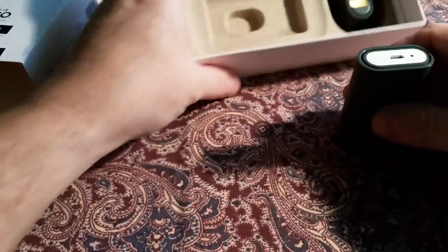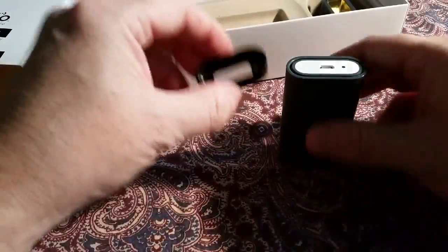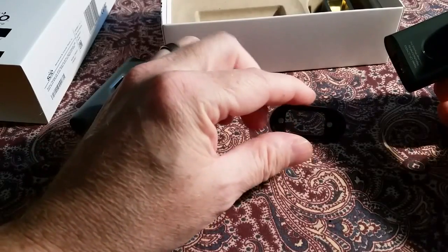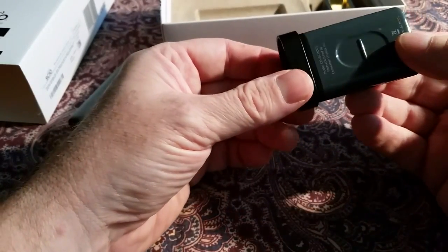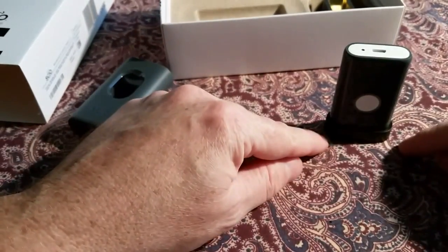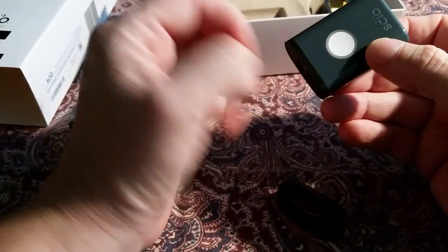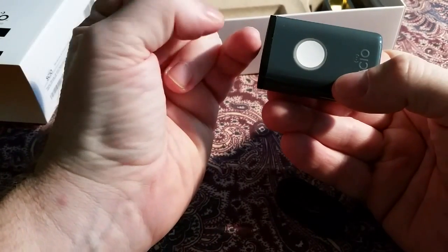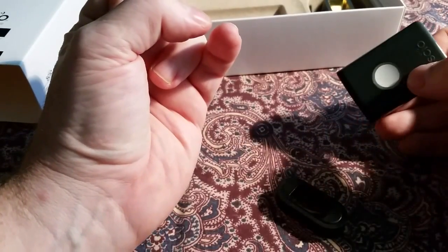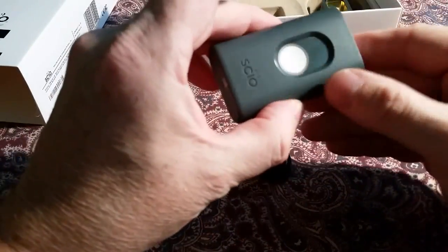As for the little holders — you can see the magnets in this one, and there are some neodymium magnets. It clicks on and provides enough space. They want you to imagine a blueberry right in front of the sensor as the sample you're sensing — that's about the distance you want from any of the sensors during scanning.